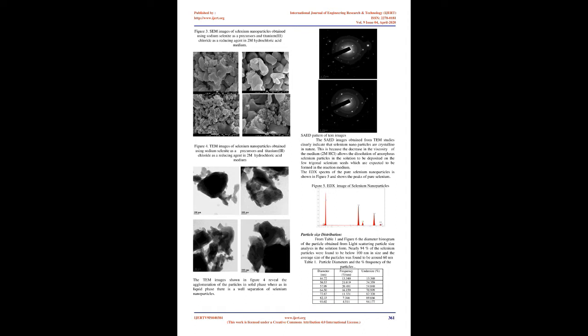Characterizations of selenium nanoparticles. The formation of selenium nanoparticles in presence of hydrochloric acid medium is primarily authenticated by X-ray diffraction spectrum. The XRD pattern obtained from the as-prepared nanoparticles is shown in Figure 1. All the diffraction peaks in the XRD pattern could be indexed as the trigonal phase of selenium nanoparticles.